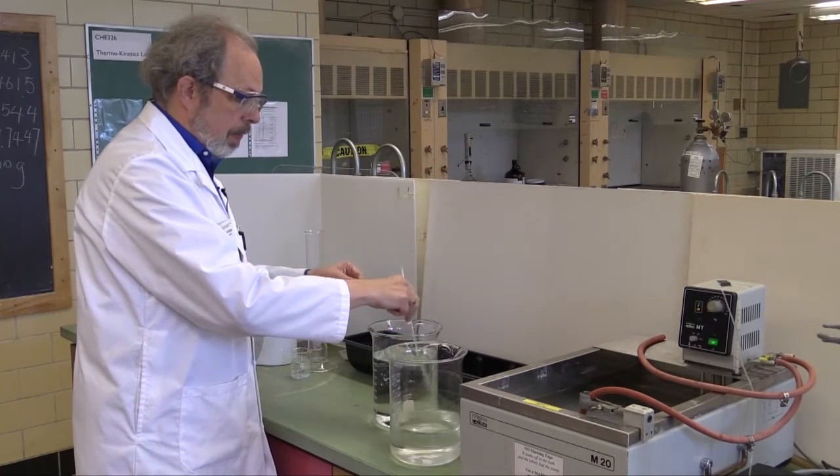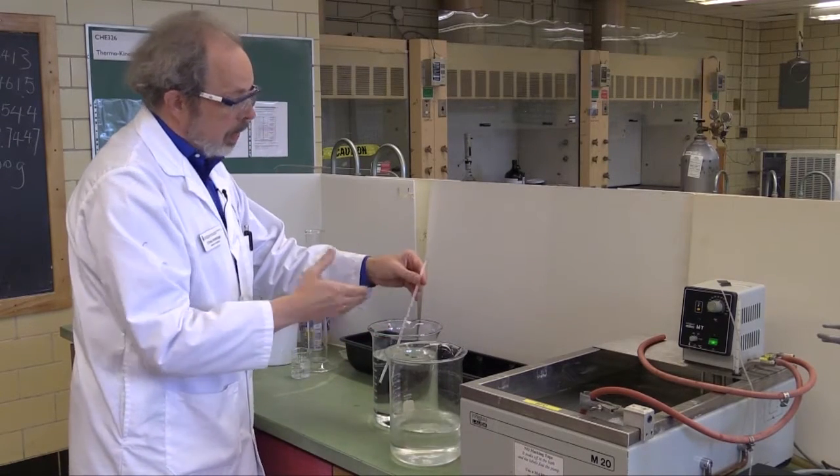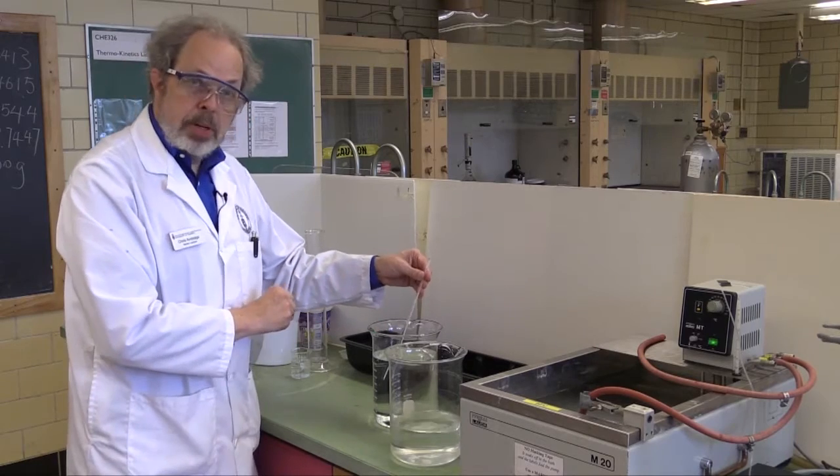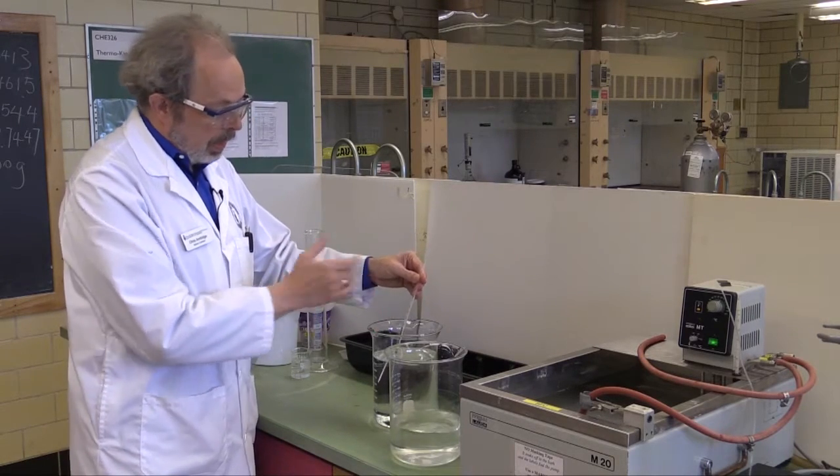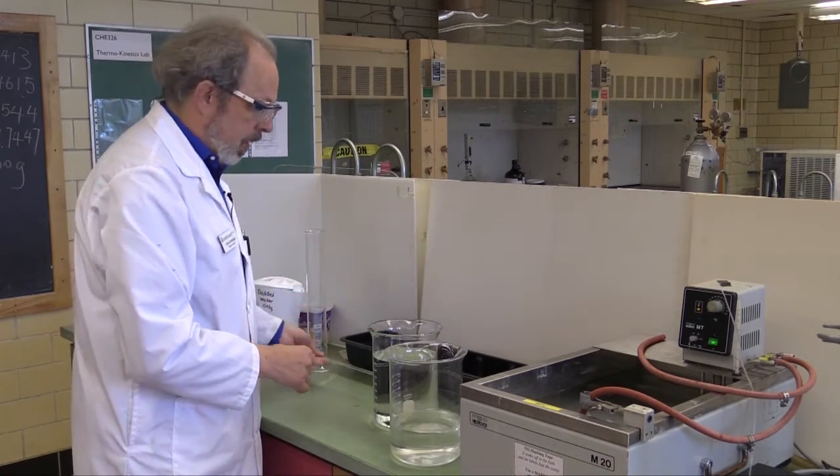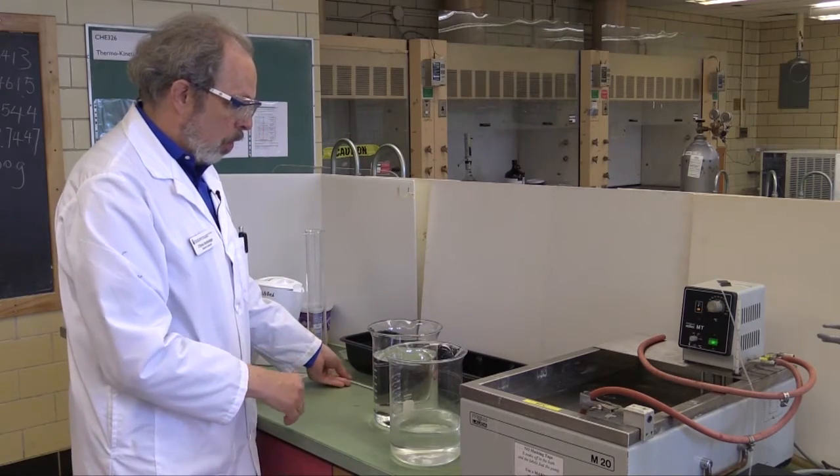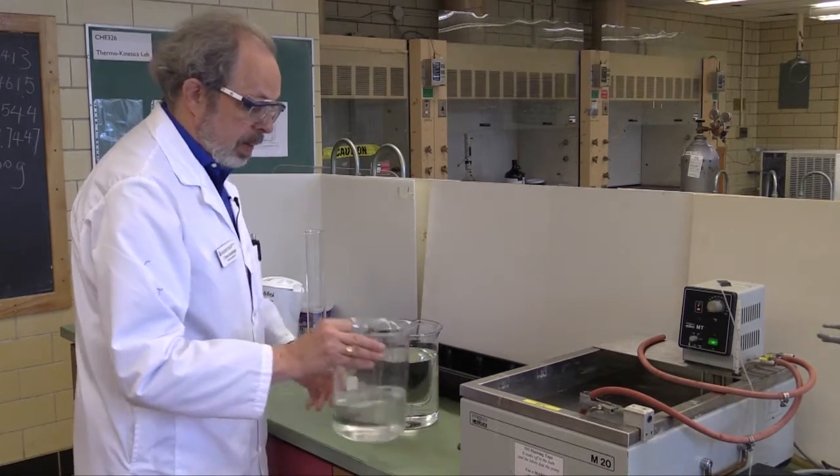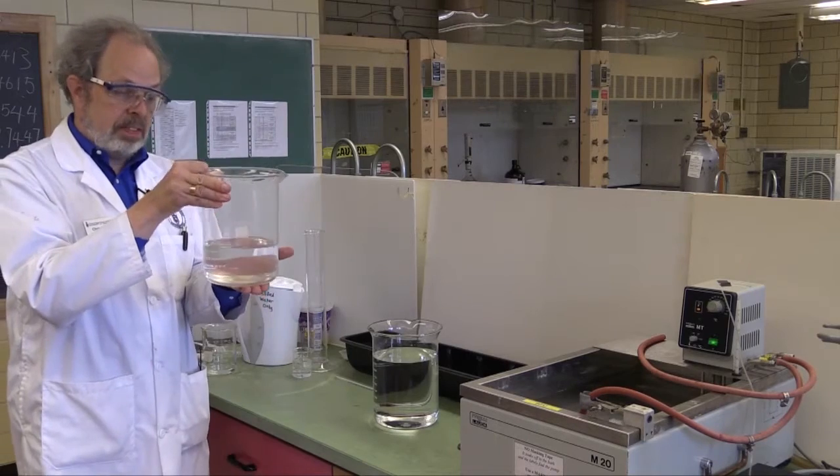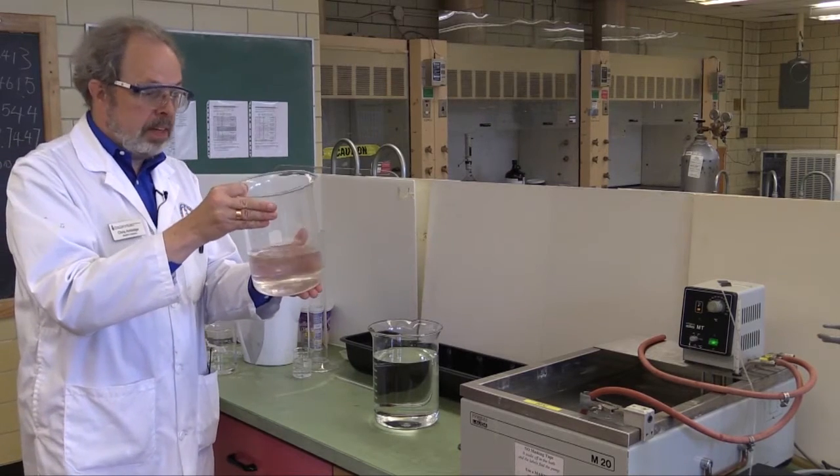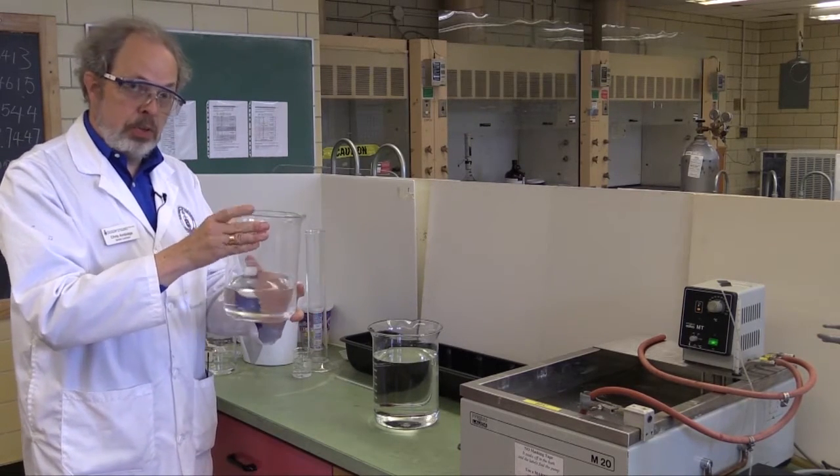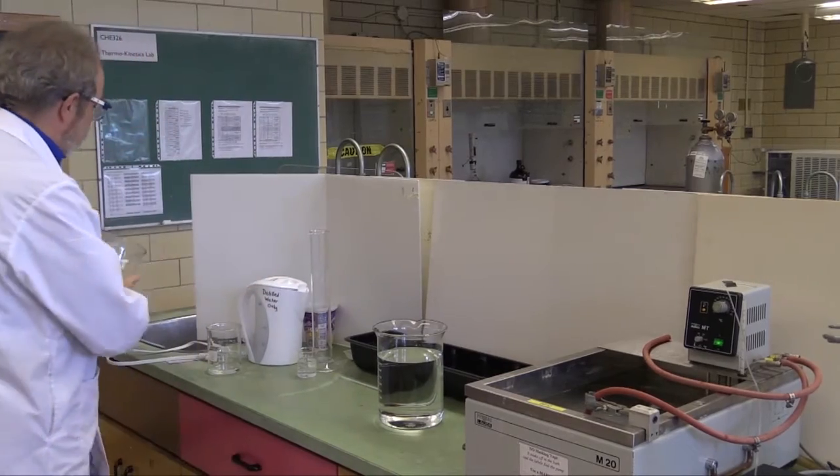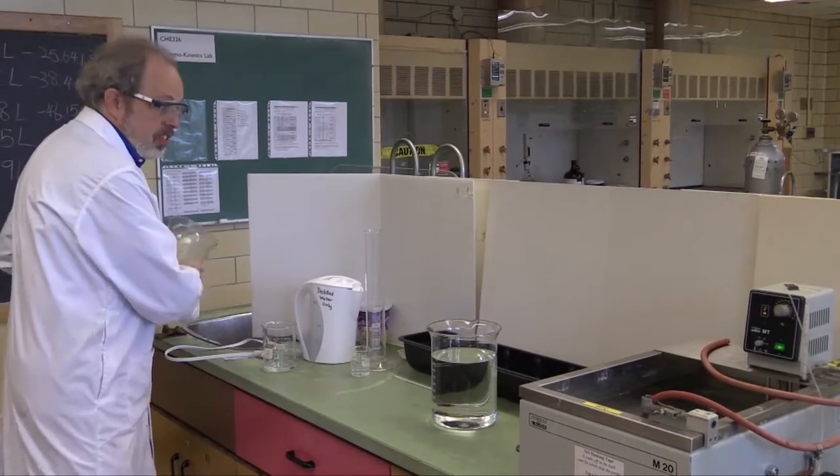Keep adding until you get to about 65 degrees. So, you would check that by stirring it to get it uniform, and check the temperature on the thermometer. Let's assume I've got this to 65 degrees, and I've got more than 2,500 mils. I'm going to use this beaker as the vessel for the solution. I'm going to empty this now.